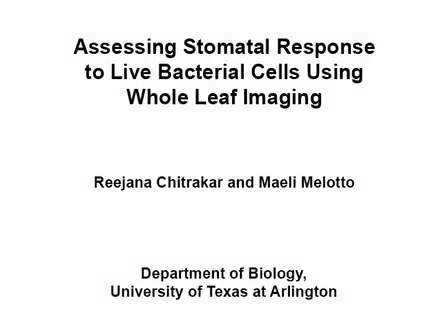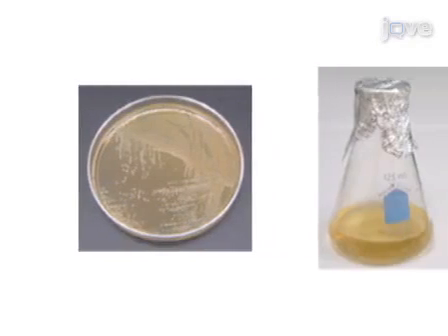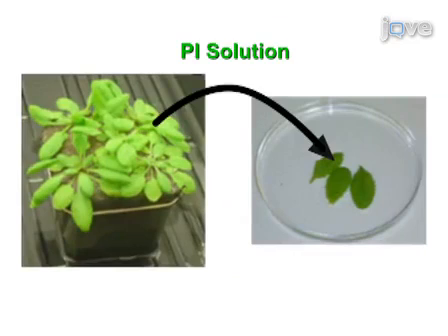In this procedure, whole leaf imaging is used to assess guard cell movement in response to live bacterial cells. First, the bacteria are cultured from a glycerol stock and an inoculum is prepared. Then young healthy leaves are collected and stained with propidium iodide.